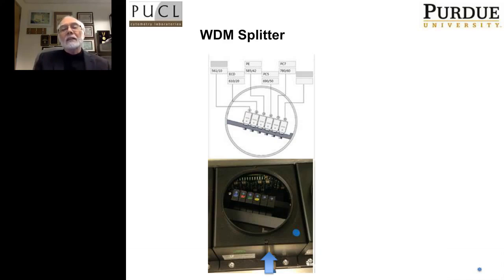Those are actually holders, and on the bottom of those holders, there's a really tiny bandpass filter. That bandpass filter is only a few millimeters wide and a few millimeters long, so it's extremely small. And so you can see in this very small area, it's maybe 40, 50, 60 millimeters, 2 inches across, that there are about 6 different bandpass filters in here.